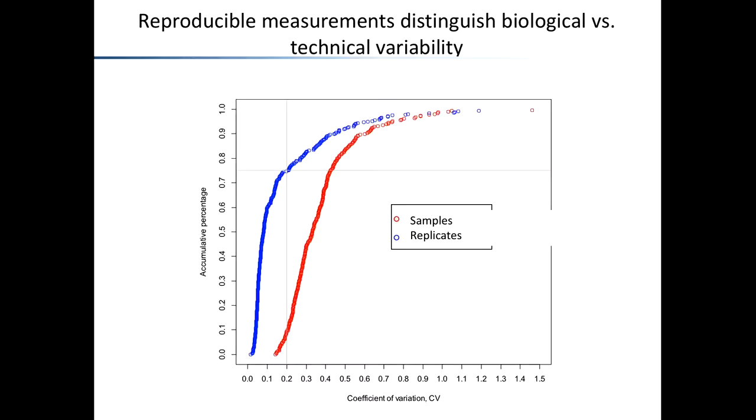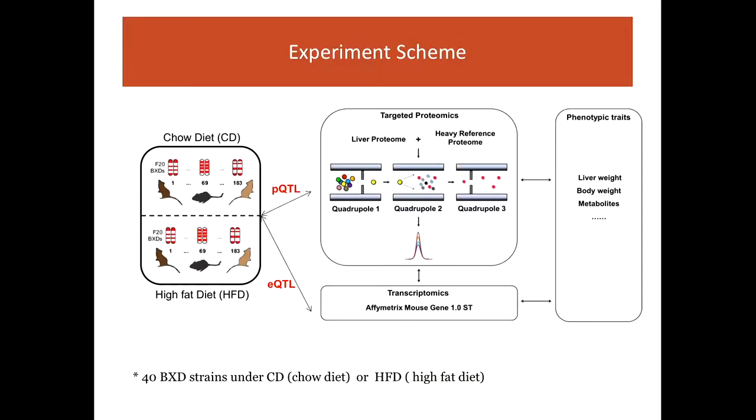And by applying these targeting techniques, we can confidently say, by this analysis of repeats versus biological samples, that we can actually see biological signal. So now I would like to show what we can learn from that.